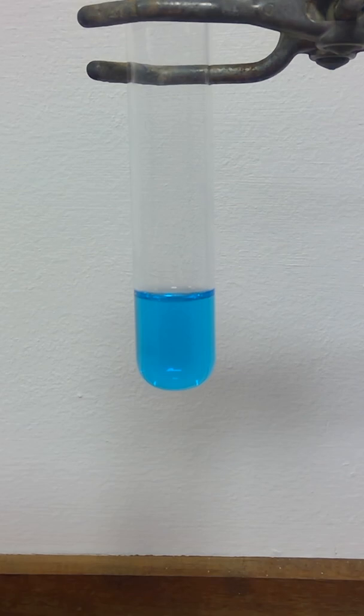This is a video that looks at the solubility of some inorganic compounds in water. It also looks at the idea of precipitation. Precipitation is the formation of a solid in a solution.